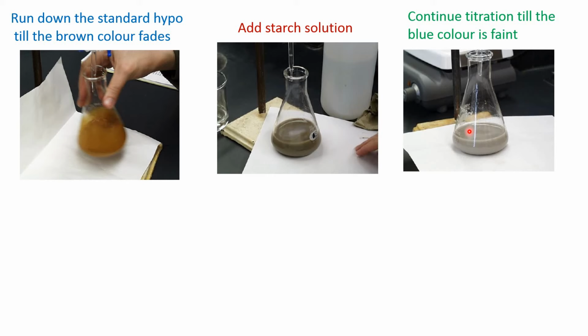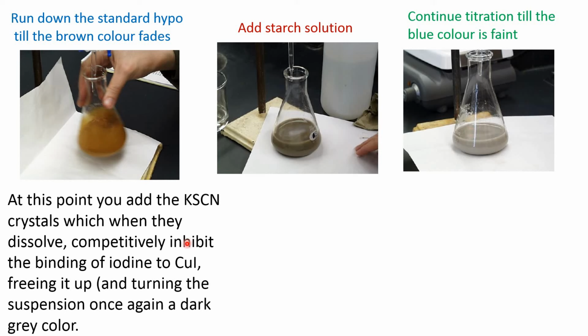Now, at this stage, you have to add either potassium thiocyanate or ammonium thiocyanate solid. Why? This is another important Viva question. Because some of this iodine gets adsorbed at the surface of the Cu plus iodide solid.